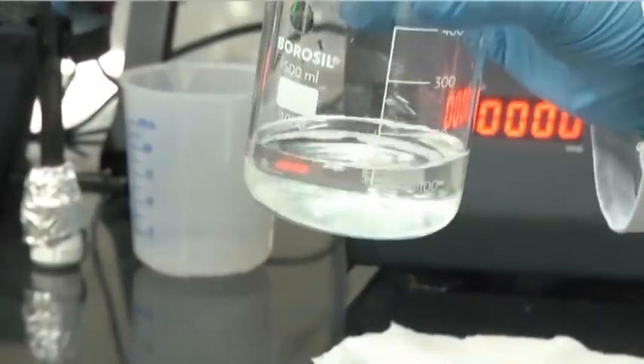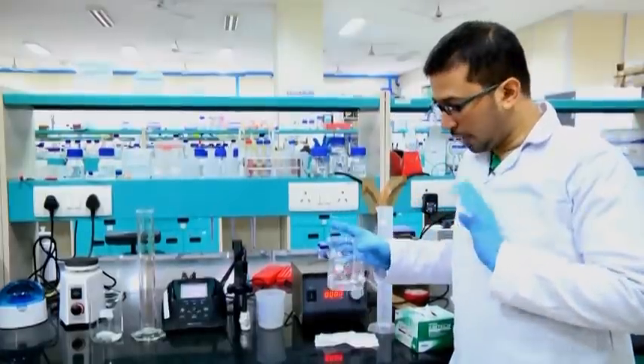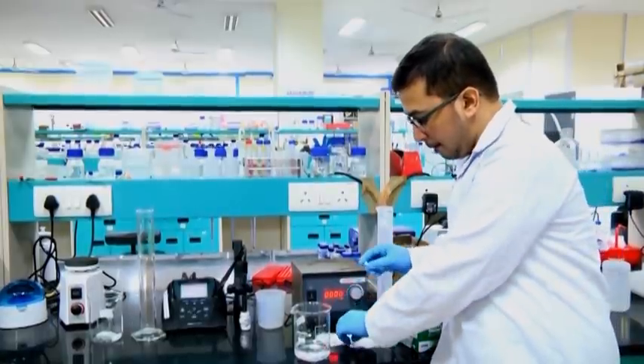Once we add, we will just stir it gently and again go on adding. Here we can see small chunks or aggregates of this compound sometimes form after adding double distilled water. To remove this, we need to use a magnetic stirrer, and this magnetic stirrer calls for a magnetic bar.